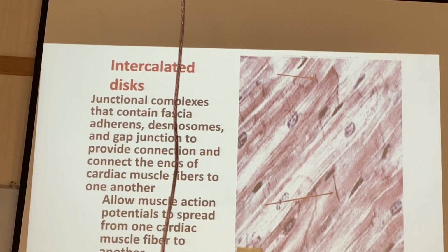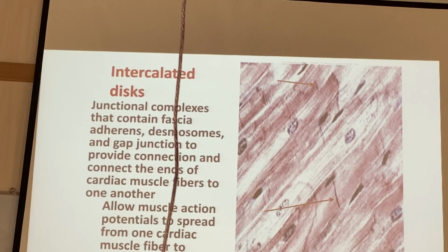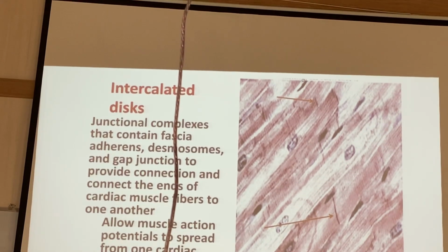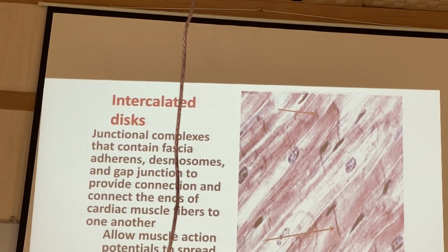We are talking about the muscle cell and saying that the cell-to-cell junction in the intercalated disc, there is a cell communication like what we have described in the epithelial cells.